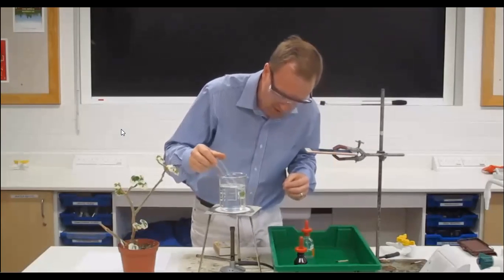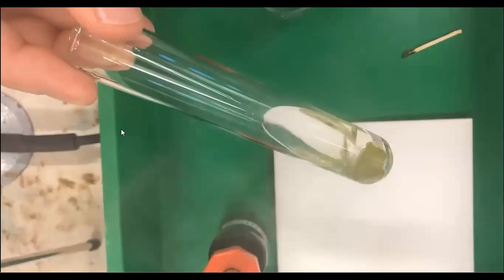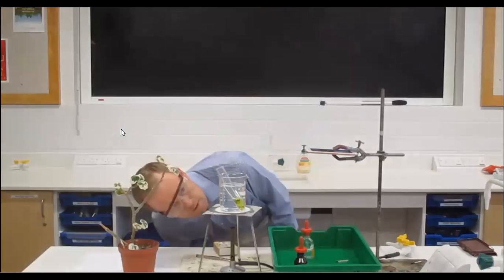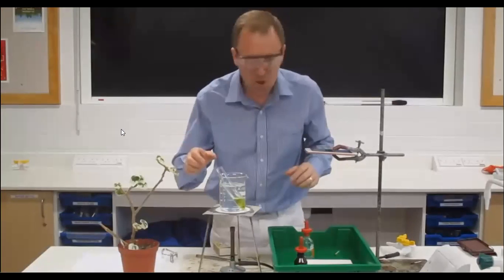Well, our ethanol is boiling very nicely now. I'm just going to hold this under our camera here. You can see it boiling really, really well. We're going to leave that for 2 minutes and come back to it. Yeah, that is pretty much there. It's done very well. We've done our 2 minutes.